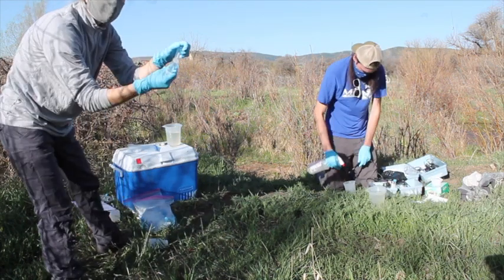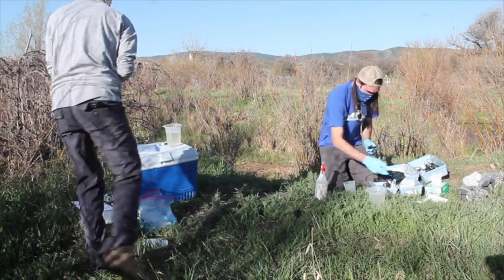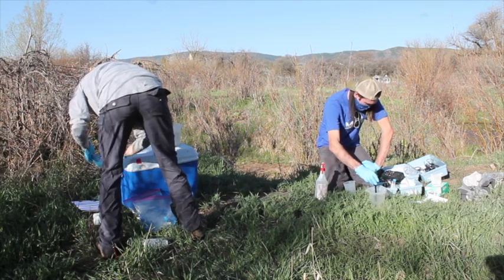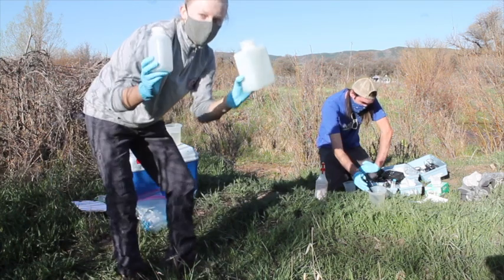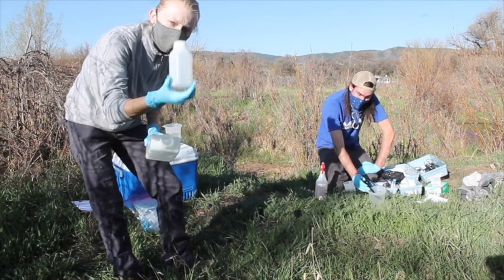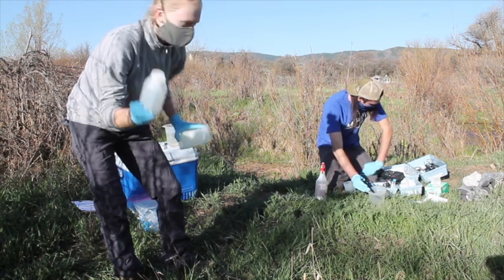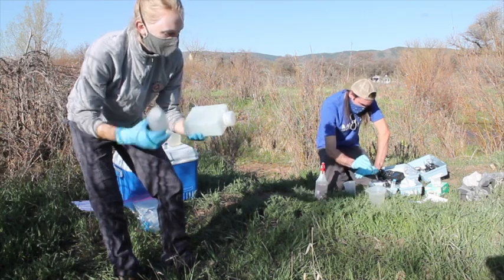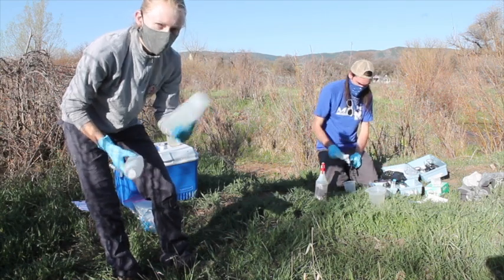Now I'm taking my total metals sample — that's just straight water, unfiltered. Then I'm going to jump down to the creek to fill the fecal coliform bottle, which should be sterile, so I won't open it until I'm by the creek, quickly submerge it, and cap it to avoid contamination. This last bottle is for total suspended solids.